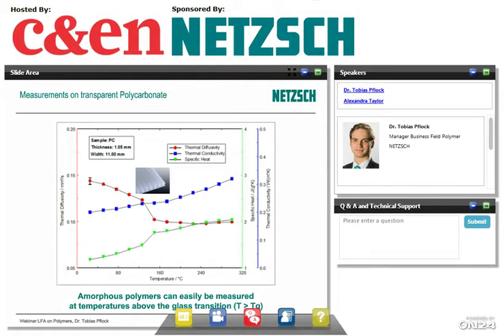What is the minimum thickness of a film that you can measure? So you can get down to the micron range, but there are different techniques to measure thermal transport properties of films, such as thermal reflectance.